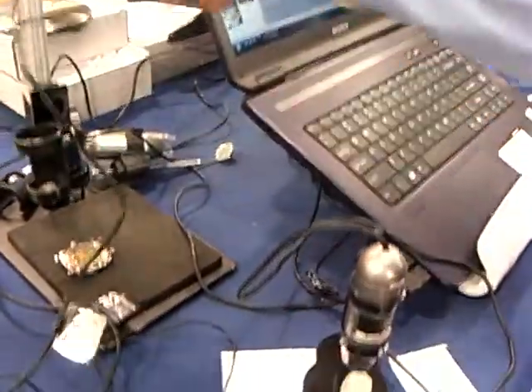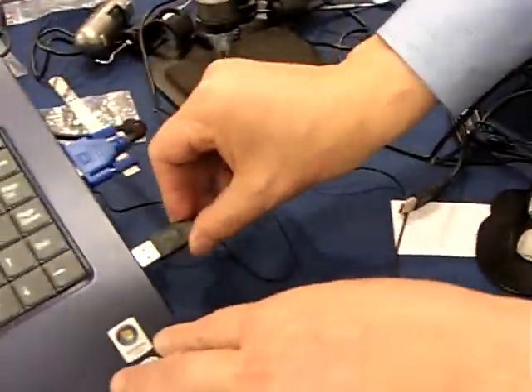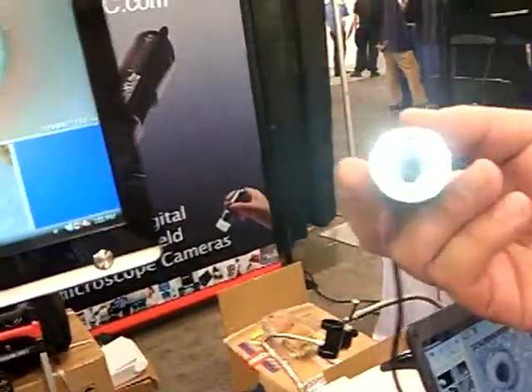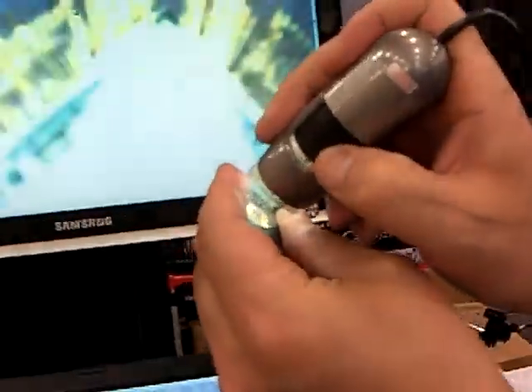Let me show you this again. I'll park it back. You can see the object like that. Position it here, see the full screen, point it here, and focus.